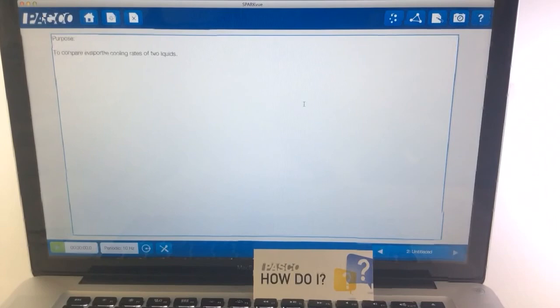And I can copy that image and bring it over into Word and paste.